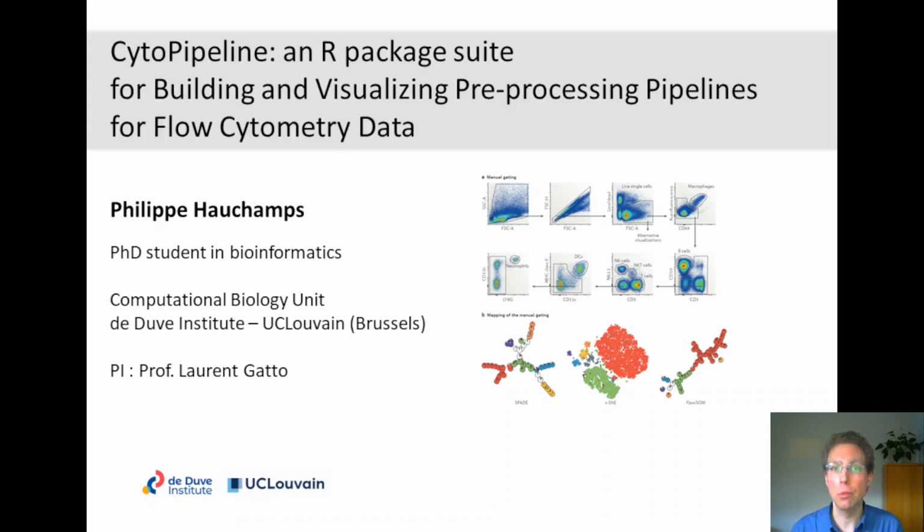In this short series of videos, I'm going to introduce and demonstrate the use of a tool called CytoPipeline. CytoPipeline is a suite of R packages that I'm currently developing as part of my PhD, and which is aimed at building and visualizing pre-processing pipelines for flow cytometry data.